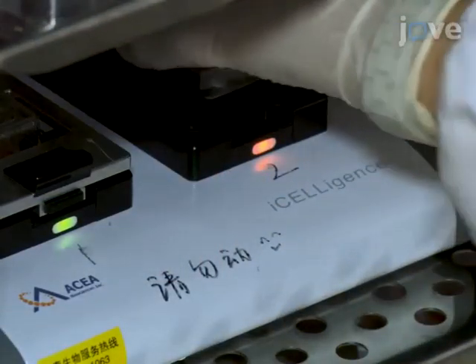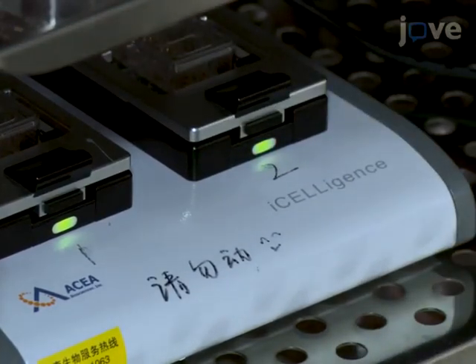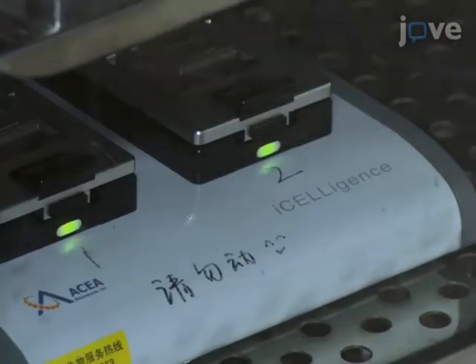After 30 minutes, manually insert the electronic plate L8 in the real-time cell analyzer in the CO2 incubator at 37 degrees Celsius.